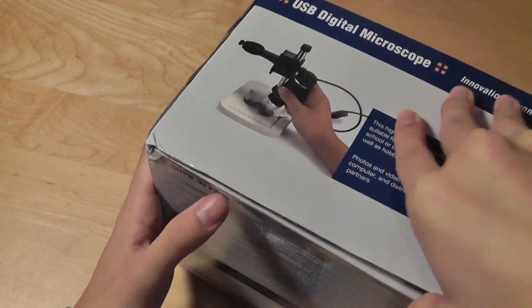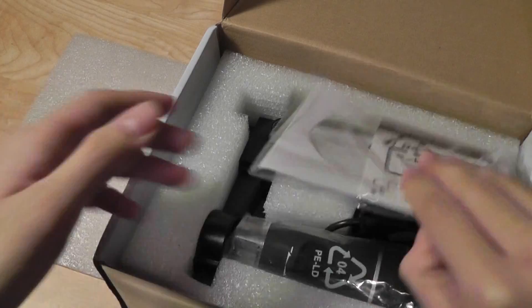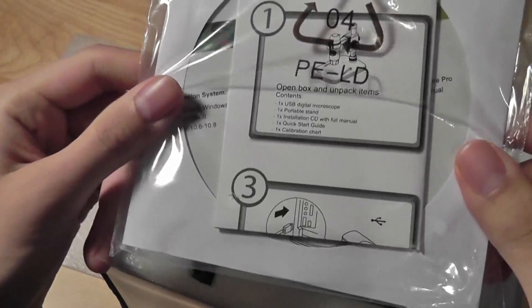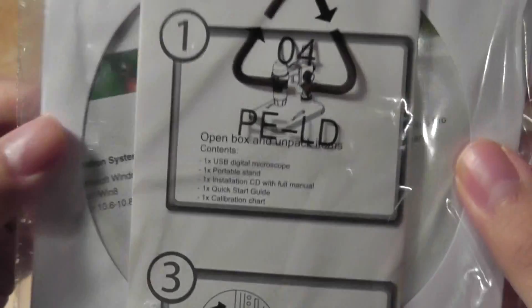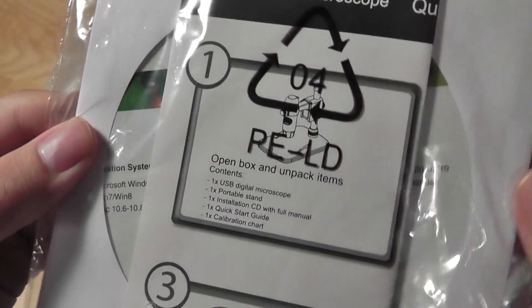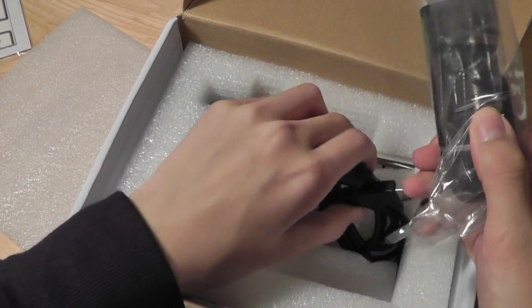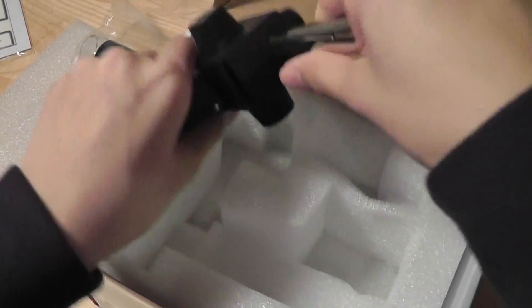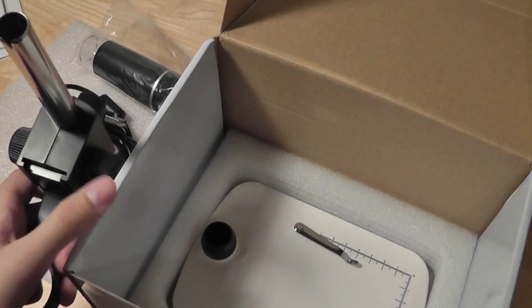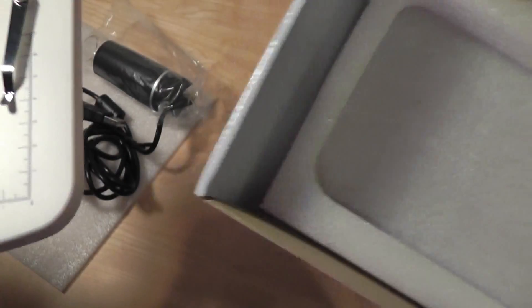Taking a look at what's included inside the packaging, we have the aforementioned software, the quick start guide, and the calibration chart on the back. That's used to check how the microscope gets into focus, and you can refer to the instruction manual for more details. We also have the digital microscope with the USB attached to it, the stand itself, and on the very bottom, the actual base of the microscope.